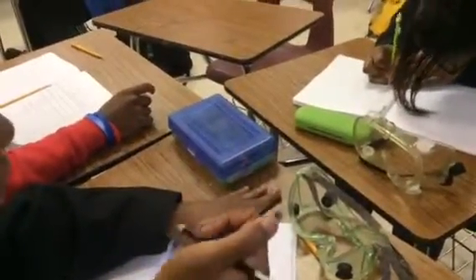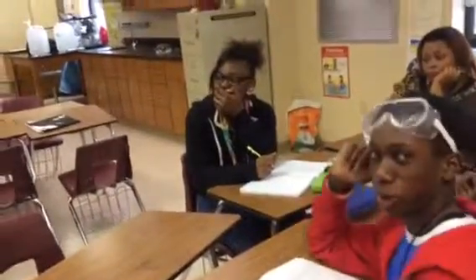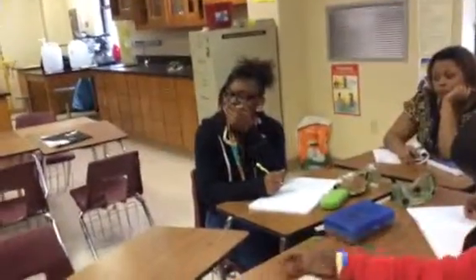Okay, what have we come up with over here? I'm working on the qualitative qualities, and I'm working on the quantitative, the numbers for the sugar. Javante, explain what we're doing today. All I know is we was working on a solution. We've got to find out, doing the experiment, before and after what happened.